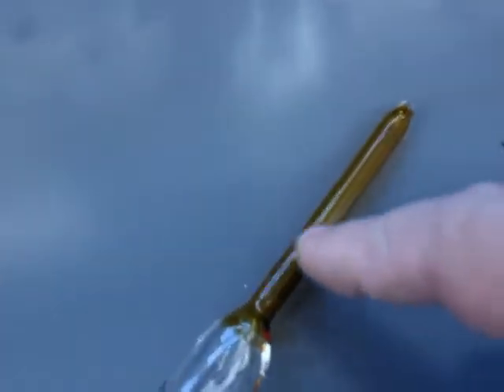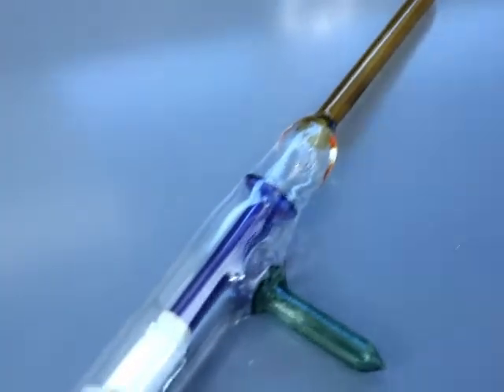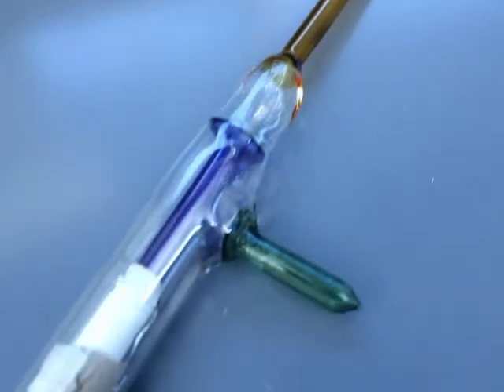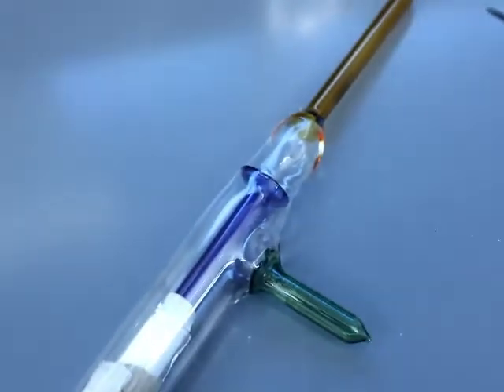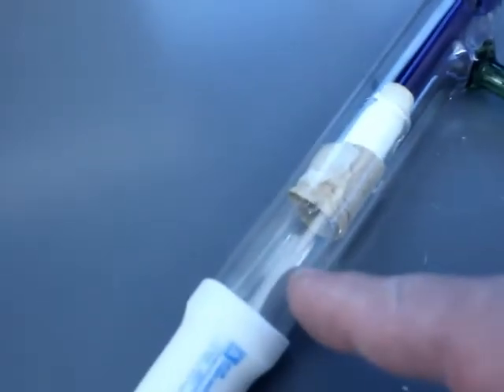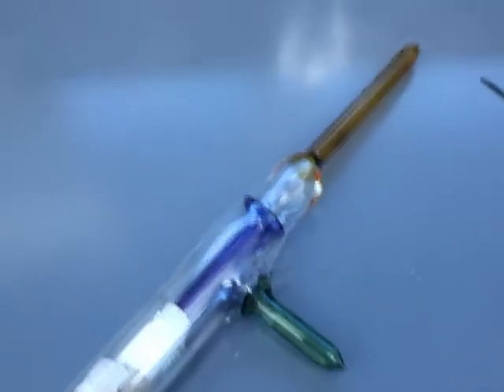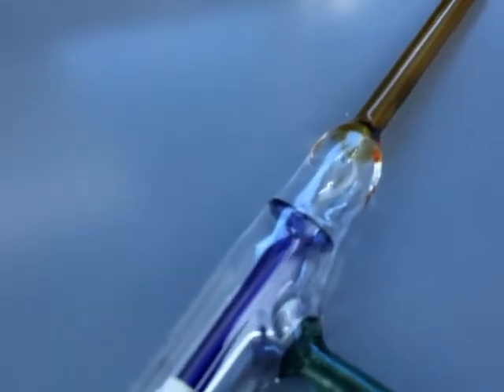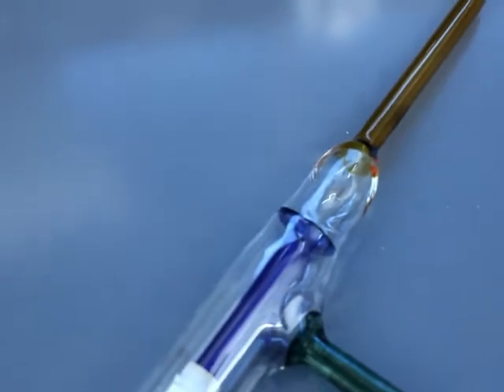Or I can bend this tube up with a gentle curve to make it a little easier to attach the hose. But these last few steps, removing this, closing this, those are all pretty straightforward. The most important thing, of course, at this point, as you're working, is to be really careful not to do anything that could cause your ring seal to break.